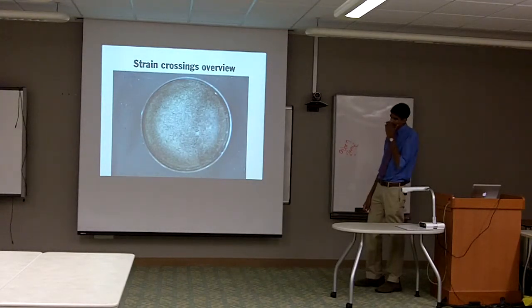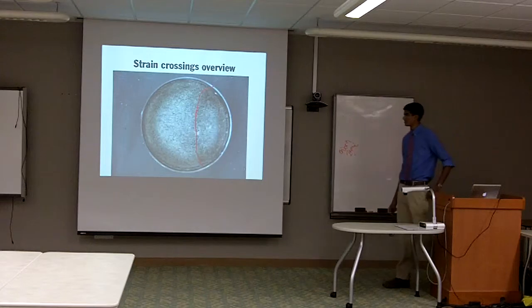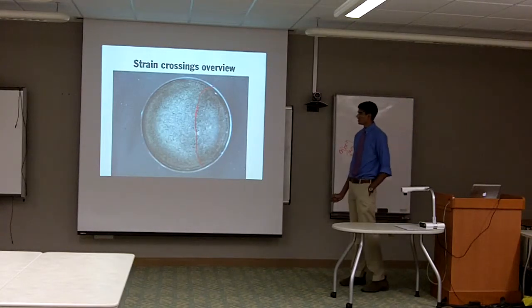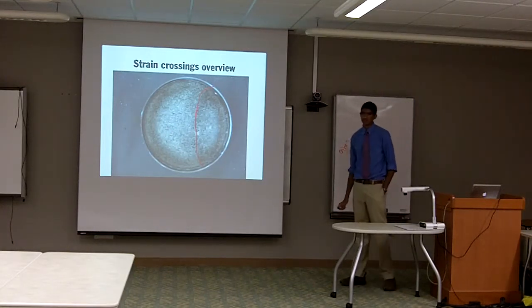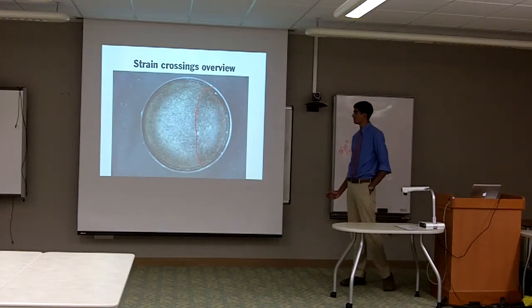So here you see a petri dish in which are two strains of Sordaria macrospora, one on the left, one on the right, and you can kind of see the contact line between where the two of them meet up. And here it is penciled in, so it's easier to see. So note how there are a lot of black dots all throughout the dish. Those are perithecia, or fruiting bodies, and remember how my fungus is homothallic, so it can self-fertilize. Therefore, perithecia form throughout the entire dish.